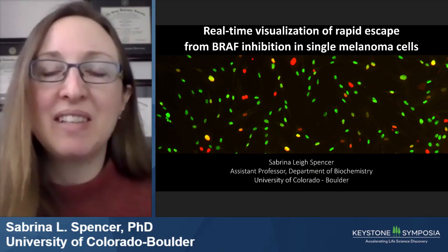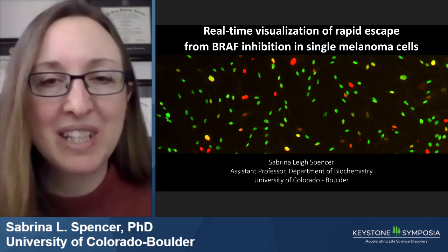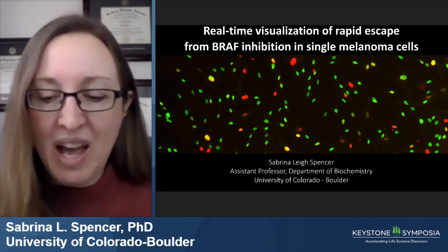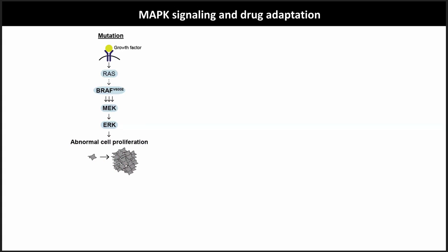My lab specializes in long-term time-lapse microscopy to study cell proliferation at the single cell level. And similar to Arjun, I will also talk about melanoma drug responses. But in this talk, we're going to focus on just the very rapid initial quick responses that melanoma cells undergo in response to BRAF inhibition, and how cells can actually escape from drug in just a matter of a few days in a non-genetic fashion.